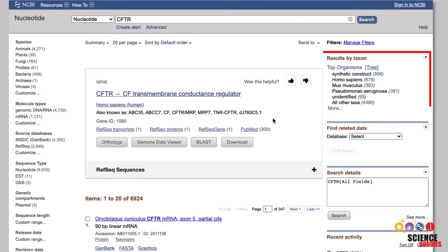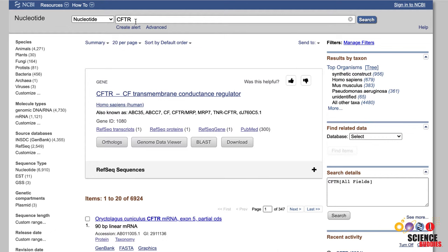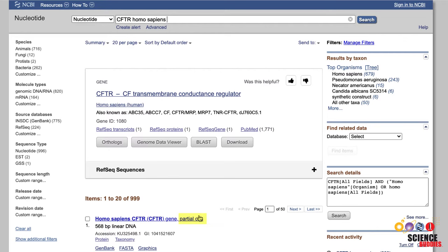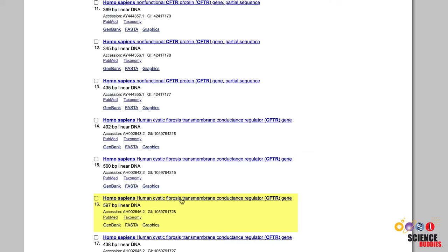Another way to refine your search is by clicking on the advanced search link underneath the search box. In the search builder, you can narrow down your search, for example by entering a specific organism or looking for a specific search term. A simpler way to do the same thing is to go back to the original search box, where you can add your specific search terms or organisms into the search box together with your protein or gene name. Note that some of the database entries are partial sequences — you want to select a full or complete sequence for your research. It might take a while to look through all the results until you find the right one.